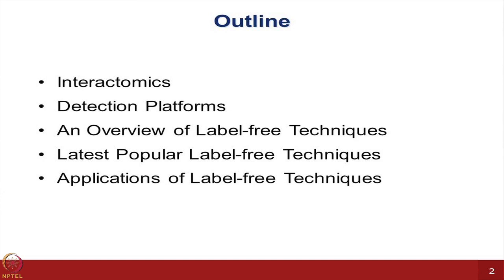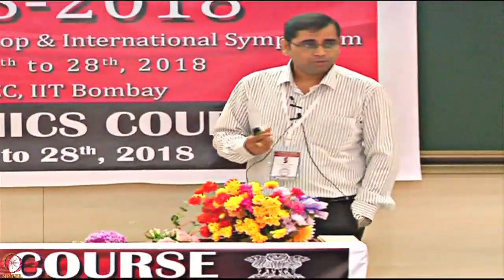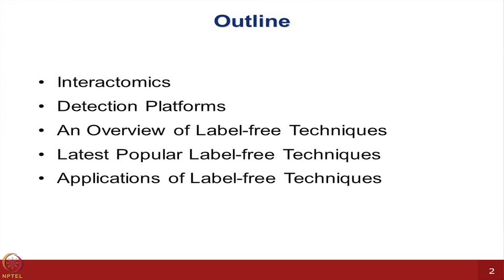Then some overview of the label free technologies. There are many, in fact. You just got some exposure to SPR yesterday, surface plasmon resonance, but there are many emerging technologies which have already started making some impact, though many of them are still in the testing phase. Some of the latest popular label free technology platforms as we go along in the course, and then a brief overview of applications.